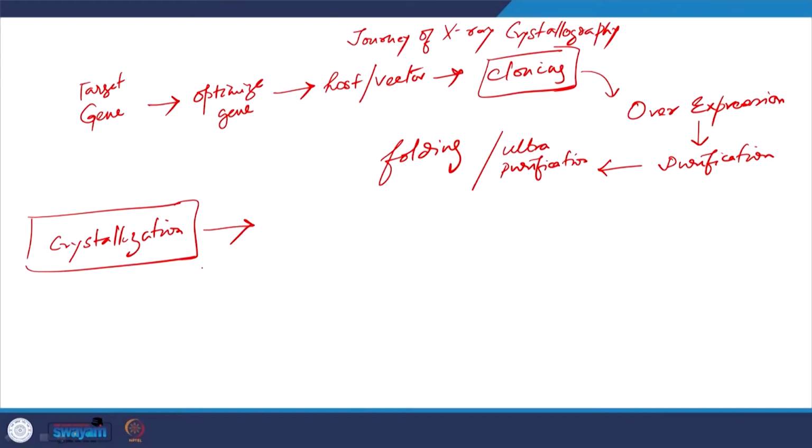We also looked at the science: what phase transition is happening, how the phase transition could be affected, and how our process could work on that. We also discussed some modern methods by which you could improve, and among them one very important is using microfluidics in the Ismagilov Lab in Chicago.